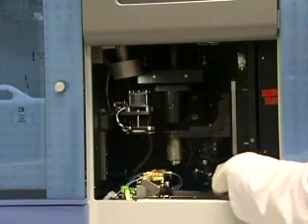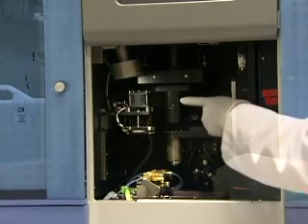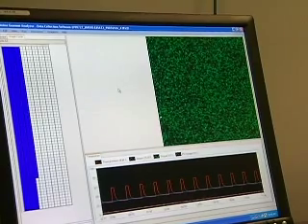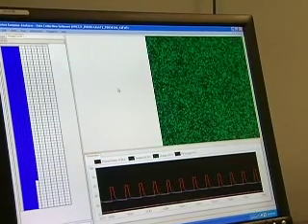It remains stationary with a laser pointing at it. The camera is positioned above the flow cell to capture images of flashes from all the clusters on the flow cell. Reversible terminators sound like a good idea. Are there any problems with this sequencing method?